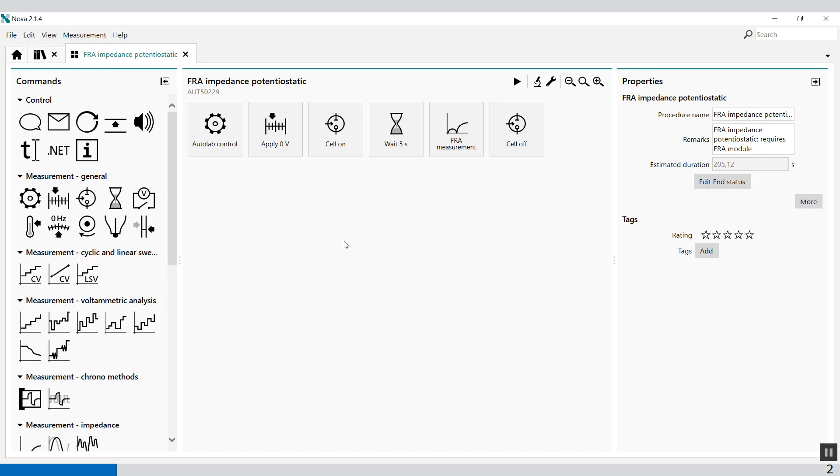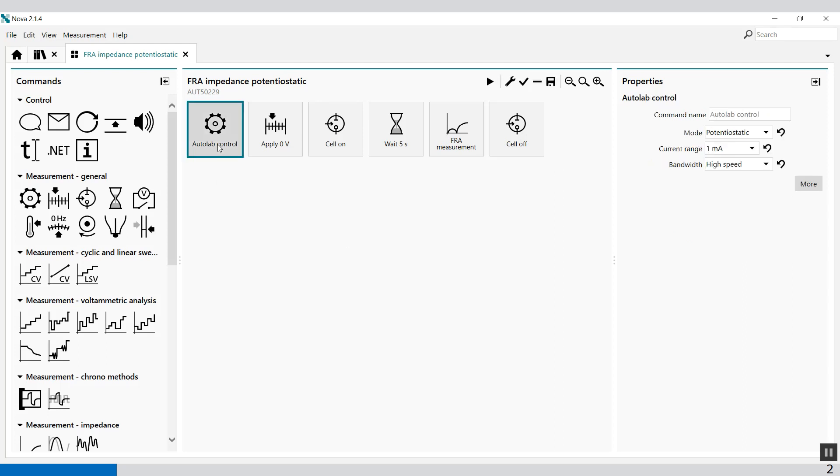The procedure is opened. The default FRA impedance potentiostatic procedure provides an example of an electrochemical impedance spectroscopy measurement in potentiostatic conditions. The potentiostatic mode is selected at the beginning of the procedure using the Autolab control command. In the Autolab control command you can select between potentiostatic or galvanostatic, but in this case it's potentiostatic.